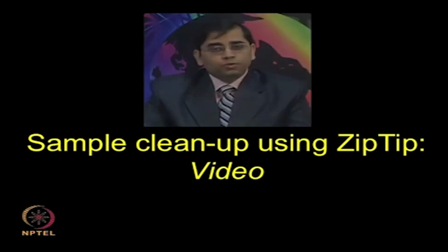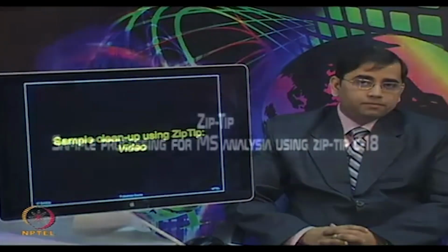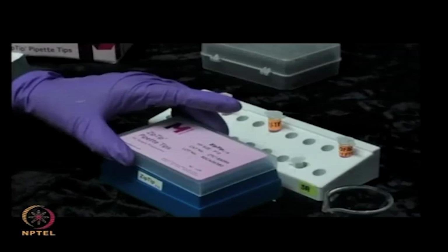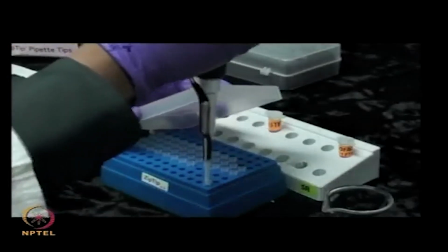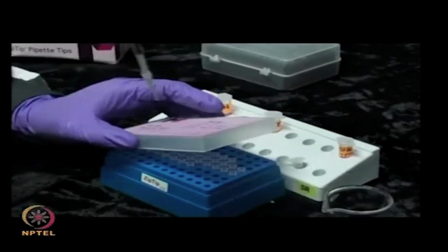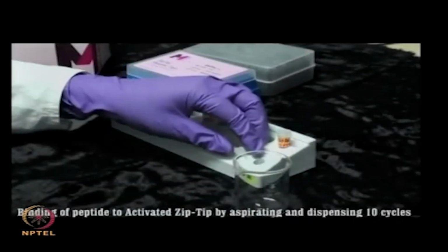Let me show you this video for the sample cleanup by using zip tips. In-gel digested protein samples can be further processed by using zip tip. This animation shows the washing solution of 0.1% TFA passing through the zip tip column.